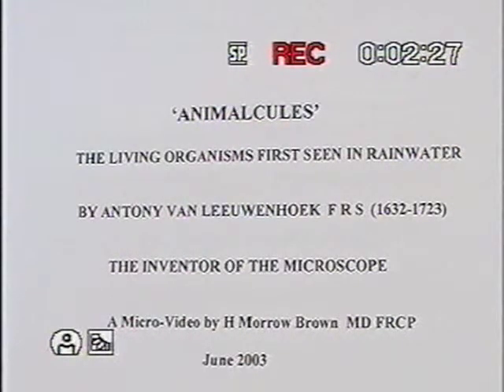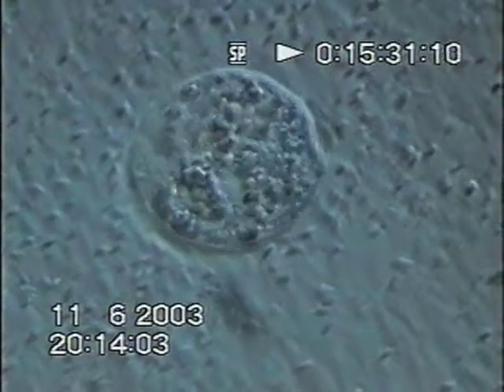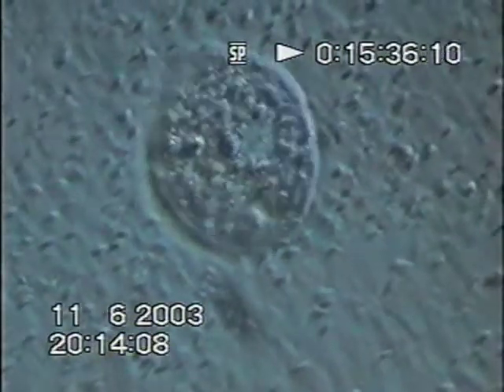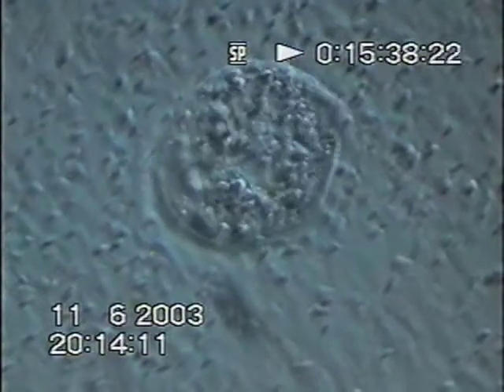Now, it seemed quite amusing to make videos of these motile organisms, and still pictures really don't have very much to say. So it was determined that an attempt should be made to produce some short videos of what we see in rainwater, especially if I'm just cutting down the aperture. I think he's performing rather well.